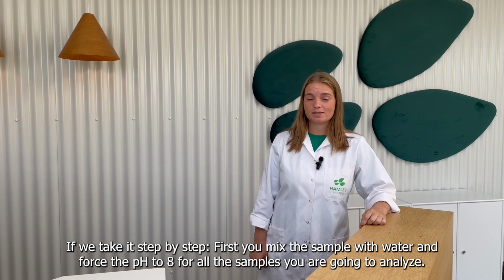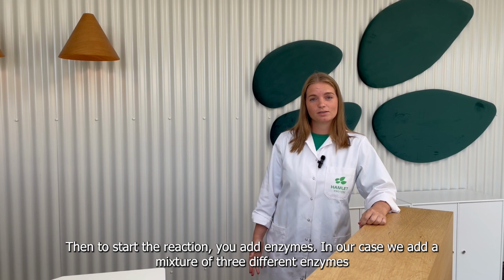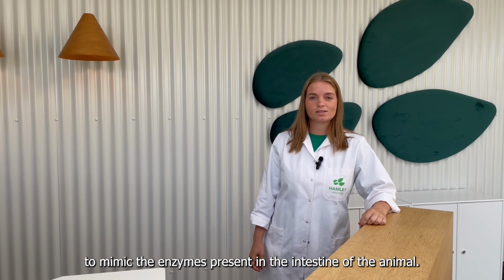If we take it step by step, the first thing you do is mix your sample with water, and then you force the pH to 8 for all the samples that you're going to analyze. To start the reaction, you add enzymes. In our case, we add a mixture of 3 different enzymes to mimic the enzymes present in the intestine of the animal.